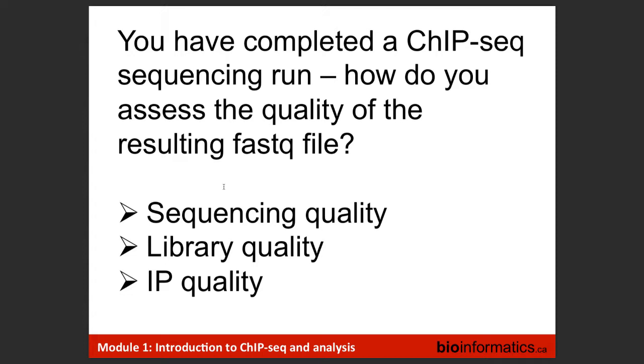The other component is library quality. How do you know that the library itself is of good quality? I was talking a little bit with Sarah at the break, understanding the biology end of things, or how the experiment was done, whether it's MNase digested, whether it was cross-linked, what kind of antibody was used, all of this is critical to your interpretation. You can have an experiment that was done two different ways, and you may have different conclusions purely based on technical differences. So you really need to pay attention to this. And of course, the IP quality itself.